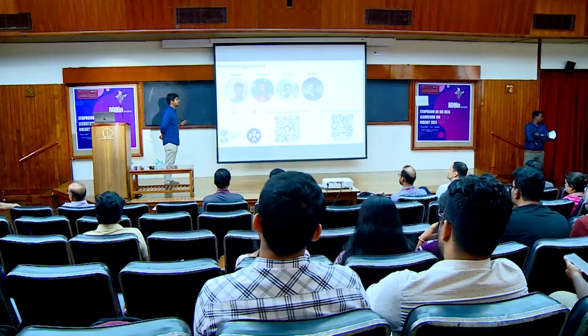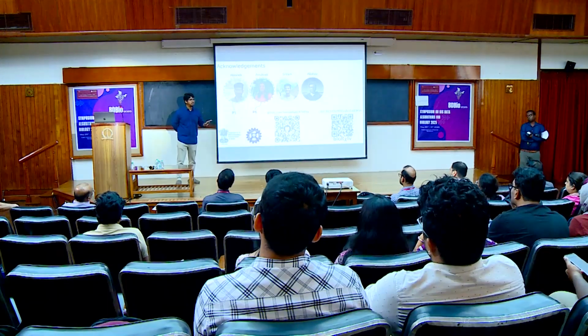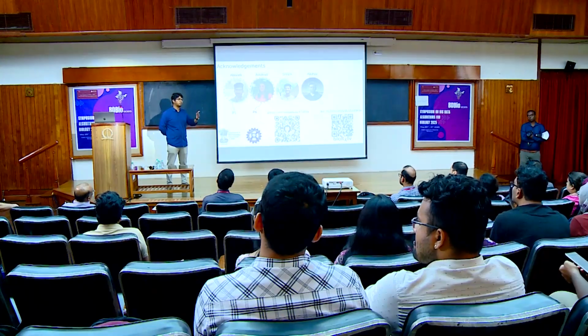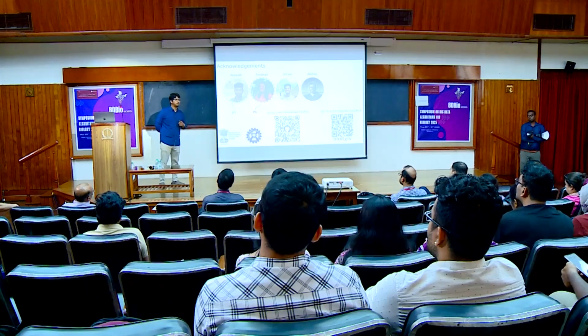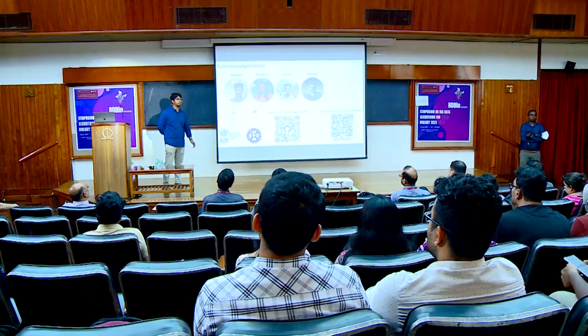The second thing is, we have seen this, even if you have 10x data, we are still able to accurately pick most of the loci. Of course, there is some loss of accuracy, but even at 10x, we are able to do well. We have not gone below that, but maybe it's an exercise that I can compare and tell you.